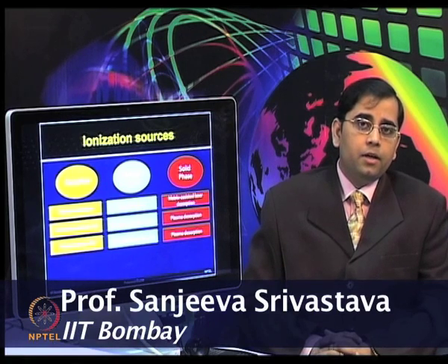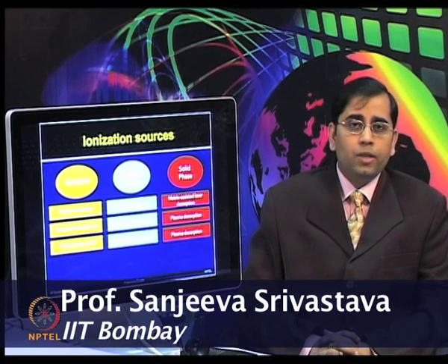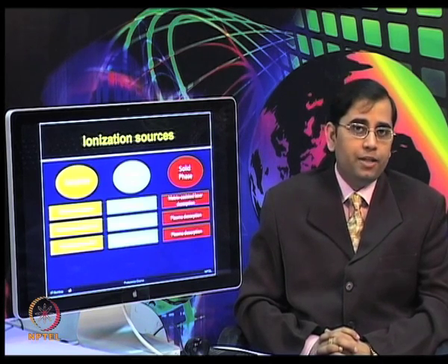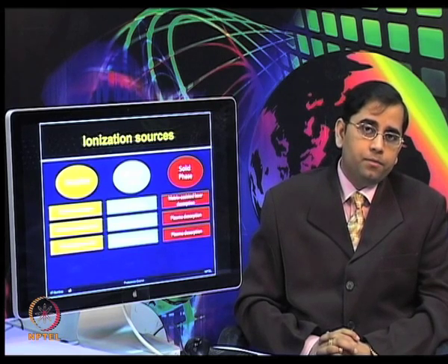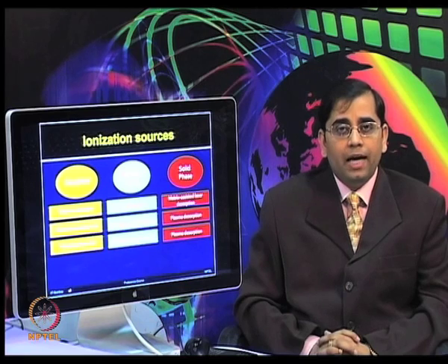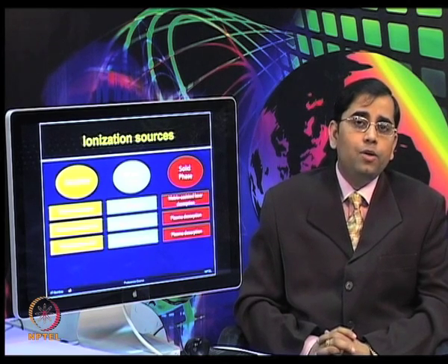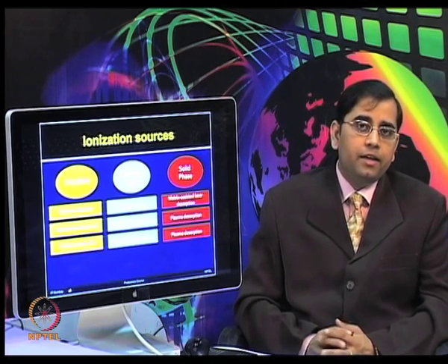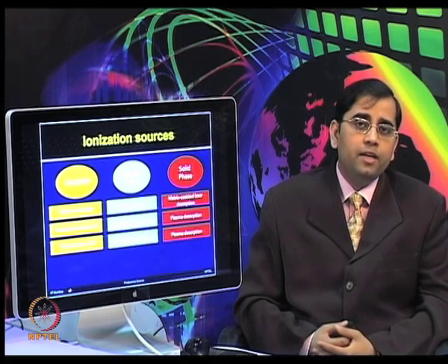So, what are the different types of ionization sources involved in MS analysis? The success of a mass spectrometry experiment lies in the efficiency of converting a neutral compound to a gas phase ionic species. You have various types of options currently available, and you can select what type of ionization source you want for your specific application. The choice of a particular ionization source is dictated largely by the nature of the sample which one wants to investigate.